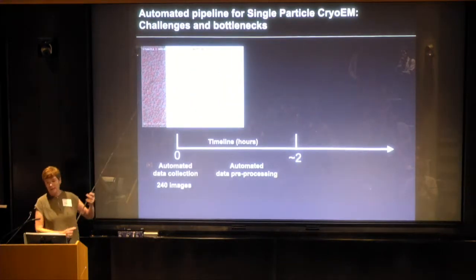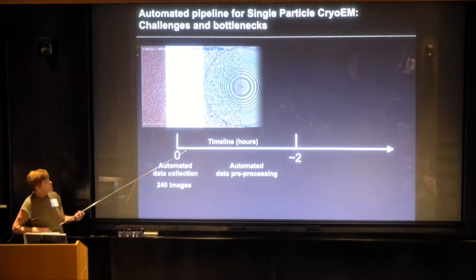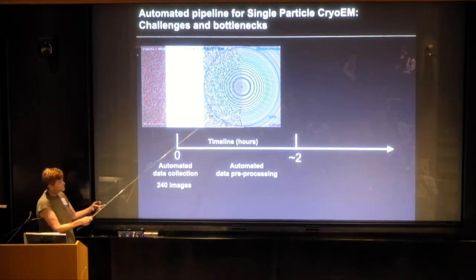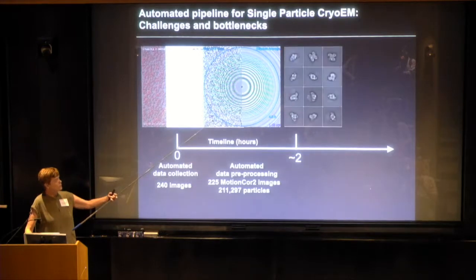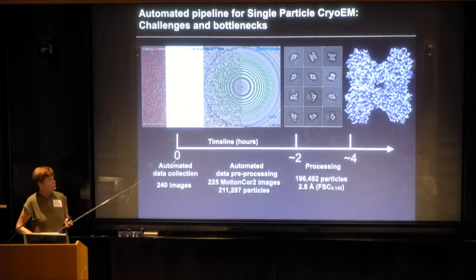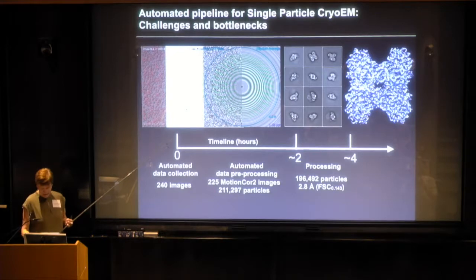We correct for that motion that you see frame to frame, so they're nice and sharp. We do some other stuff, measuring some of the aberrations in the images that we need to correct for. This is also getting better and better. And then as soon as we have enough particles, we start making these 2D class averages, and then we turn those 2D class averages into a 3D map, all through this fabulous software like Relion, CryoSPARC, and Cisttem.